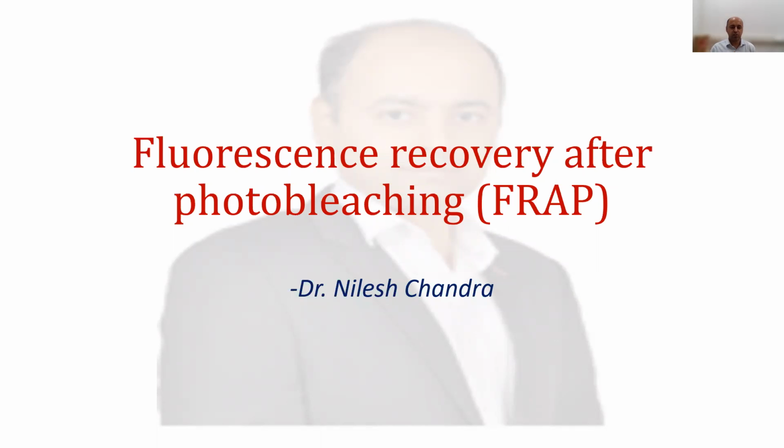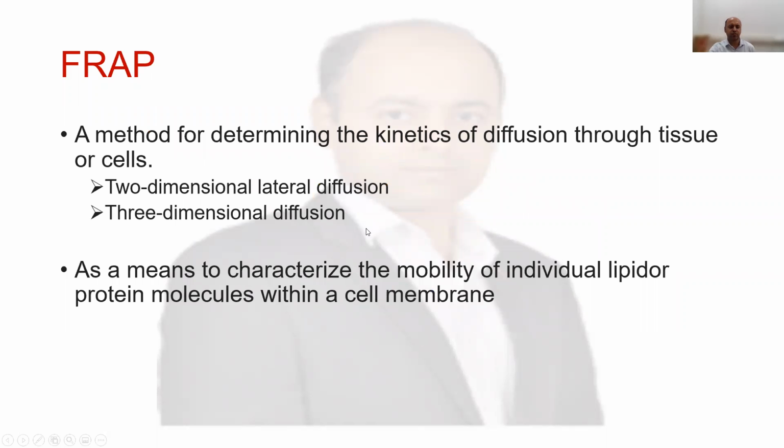We'll briefly talk about a very important technique, the fluorescence recovery after photobleaching. This is a commonly repeated question in your exam and you should know the very basics of this particular technique. So let's talk about what exactly we mean by FRAP.